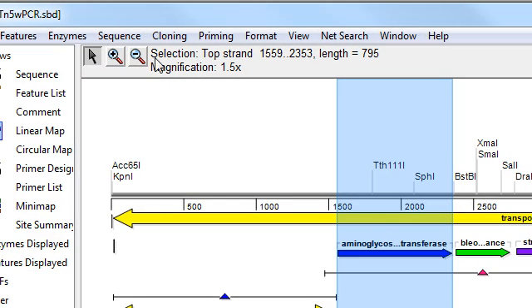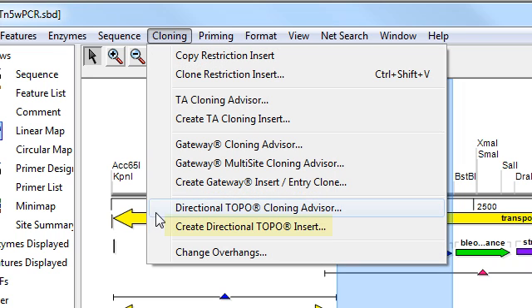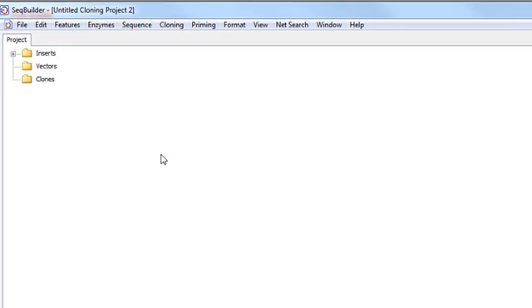So to do that, I'll go to Cloning, Create Directional TOPO Insert. And what SeqBuilder is going to do here is extract the sequence we selected and simulate its amplification using a forward strand primer with the four additional bases CACC. So I'll go ahead and click on that.